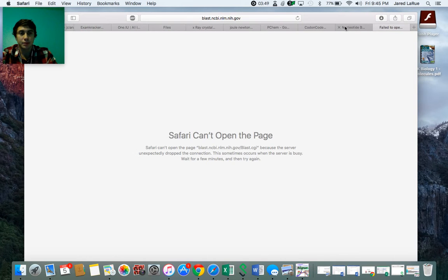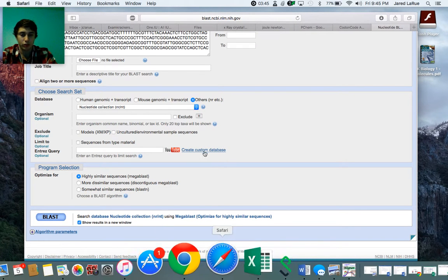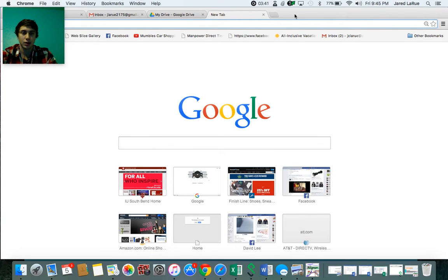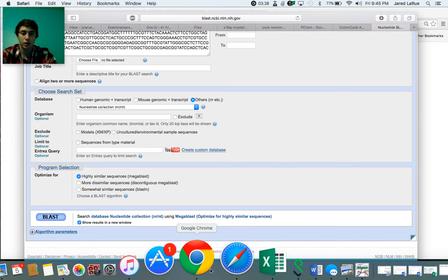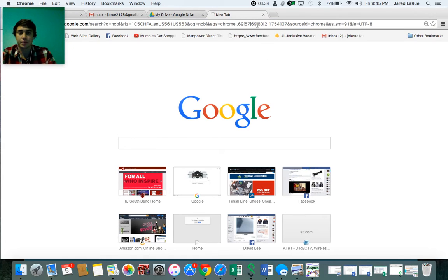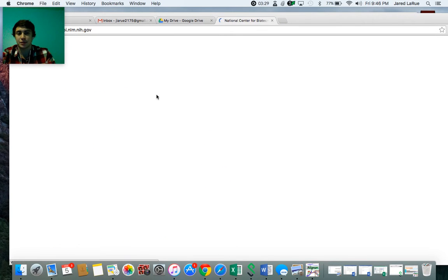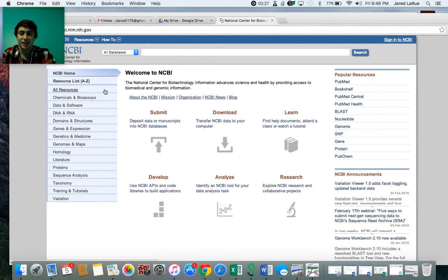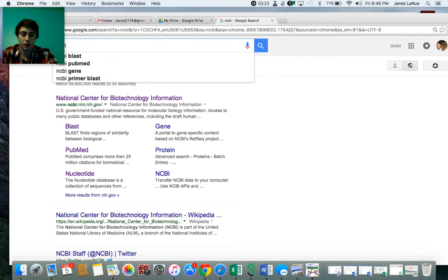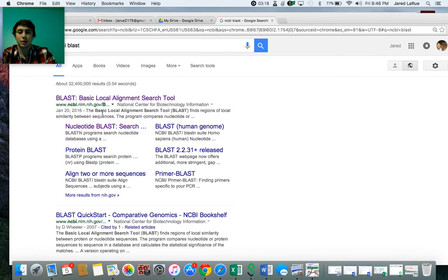In the meantime, ooh, that's not good. It's because I wasn't doing it in Google Chrome. Let me go ahead and do this in a different browser. Just a little bit of an issue because of the internet program I was using. So NCBI BLAST.